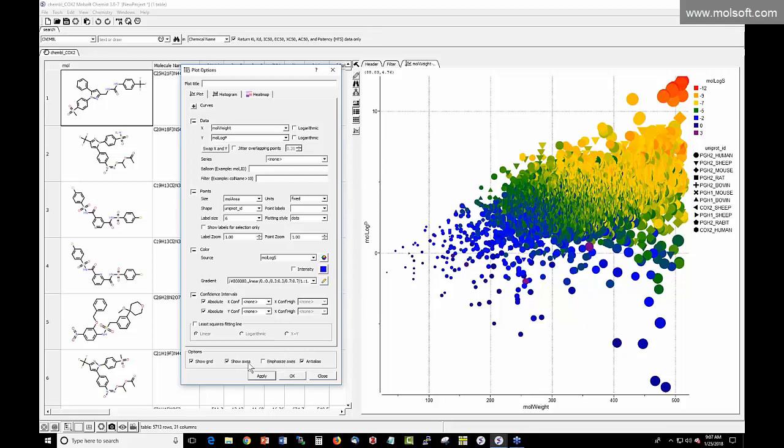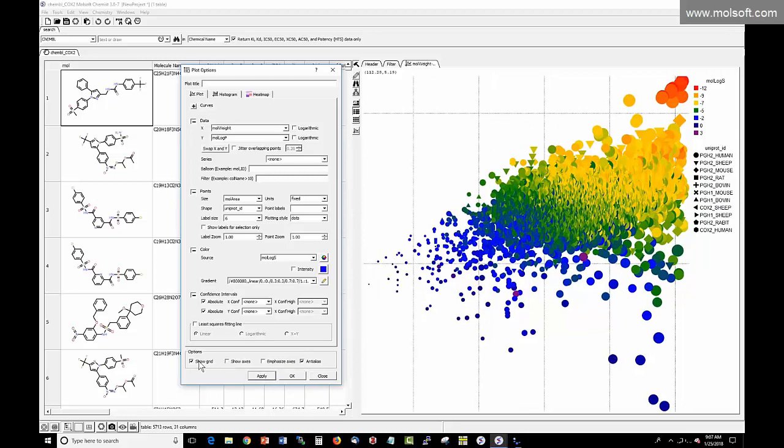There are some additional options on the bottom side. Anti-aliasing improves the graphics representation of each sphere, so they're nicely spherical, and you can check that on and off. You can also uncheck the axes and just have a blank screen, and you can also remove the grid as well. So you can just have a display like this. I'm going to add those back.